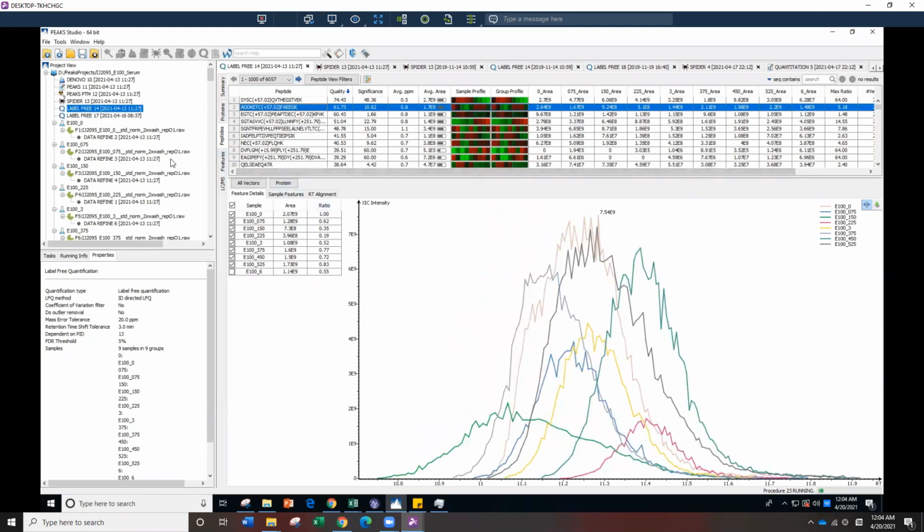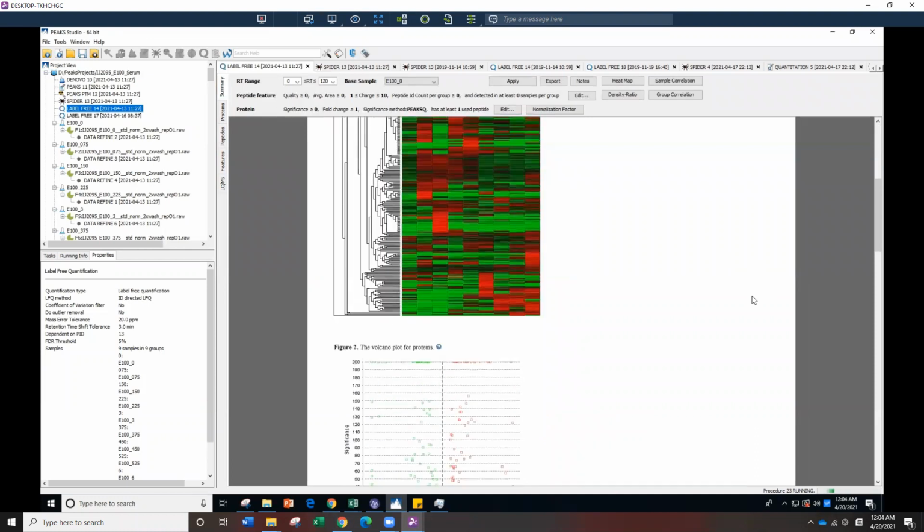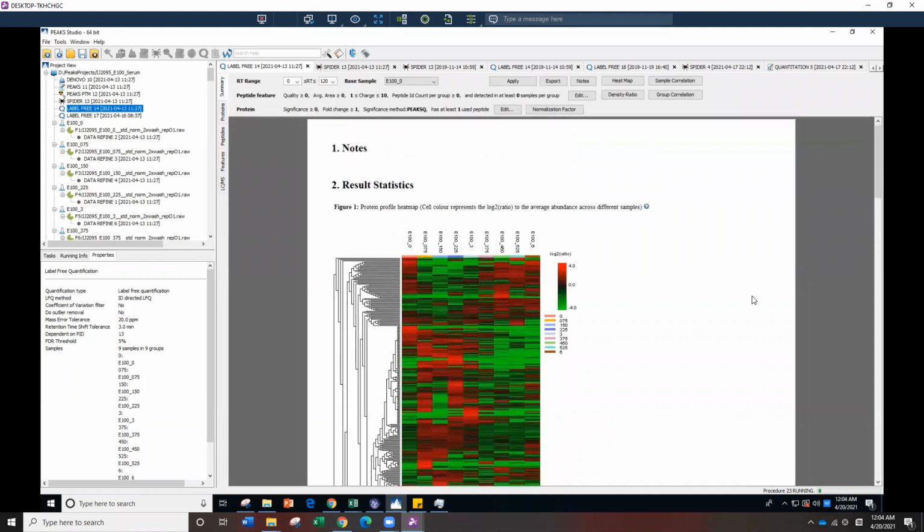So at this point I've told you most of the stuff about looking at the data. If you have further questions for your application, talk to your grad student, but this introduction should be good for you to start your Lab 6 and the training, the mock data analysis practice. It will be good practice for when you get your data for your 5B and 5C, so you can find something interesting to learn from. Okay, hope you learned a lot from this and let us know if you have more questions.